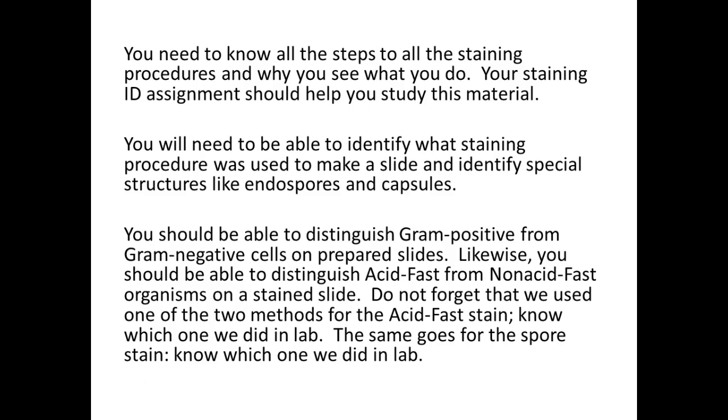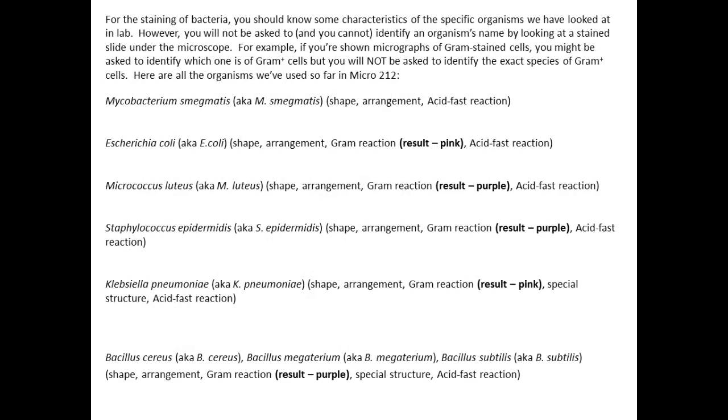Okay. You should be able to distinguish gram-positive from gram-negative, acid-fast from non-acid-fast. You should know shapes and arrangements and things like that. Those additional resources will help make sure that you know that. We've used and will use all of these organisms on this list, and we've used them for particular reasons. Mycobacterium smegmatis is what's going to be on your slides today.